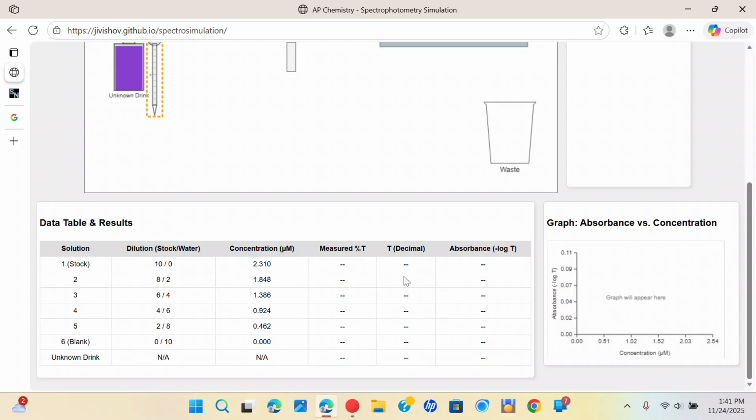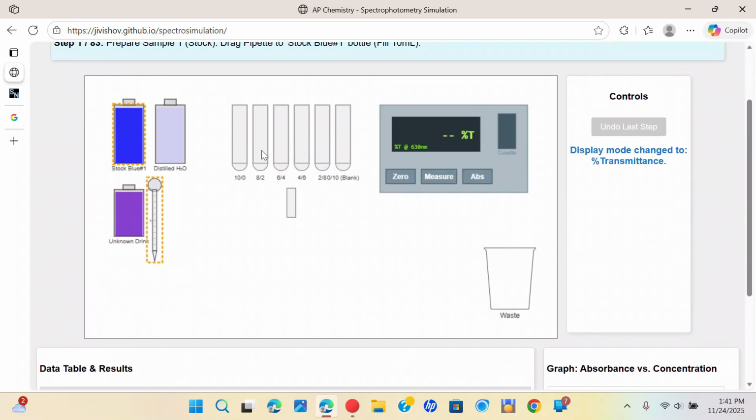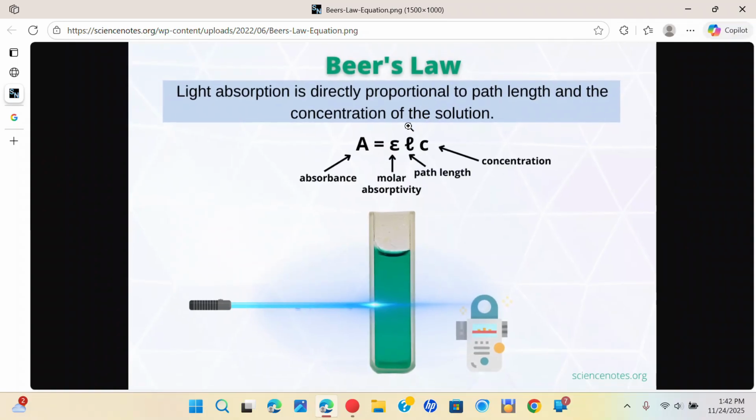And now, if you are wondering how the concentrations of the samples were found, since we were not originally given them, as you will see later in the experiment, well, nice catch. After finding the relative absorbances of these samples in the colorimeter, all one has to do is plug it into Beer-Lambert's law and rearrange the equation to find the sample's concentration.